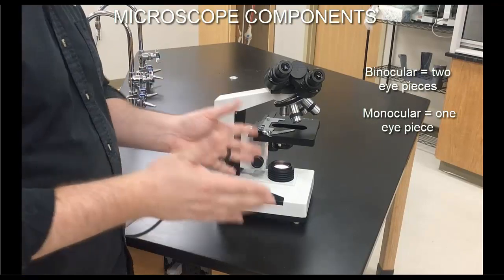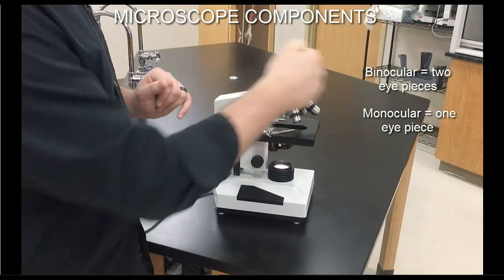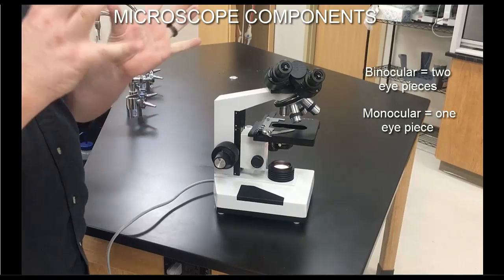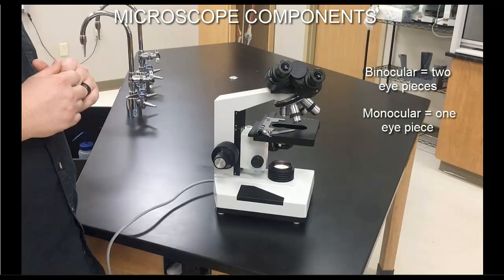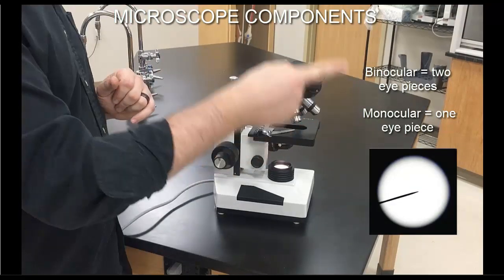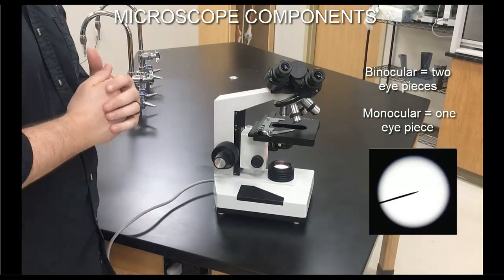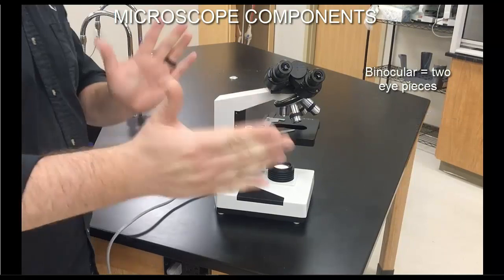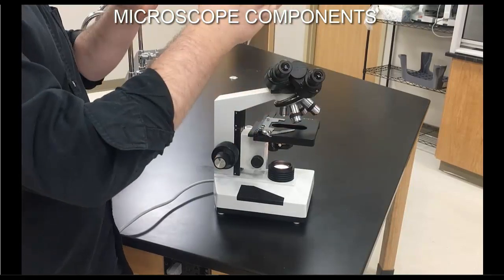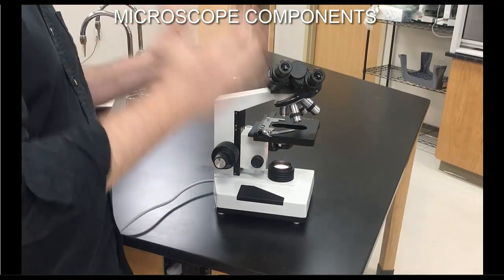You don't have to look through both eyepieces unless you want to find that comfort zone. If you're going to close off one eye, recognize that one of the two oculars will have a pointer in it — a little black arrow designed to show someone else what you're looking at under the microscope as you take turns viewing. So to summarize the ocular: it's what we look through, it has built-in magnification, and it comes as one or two eyepieces.